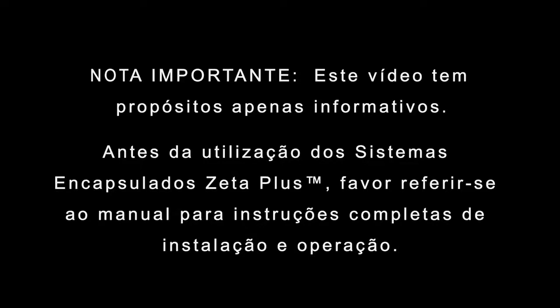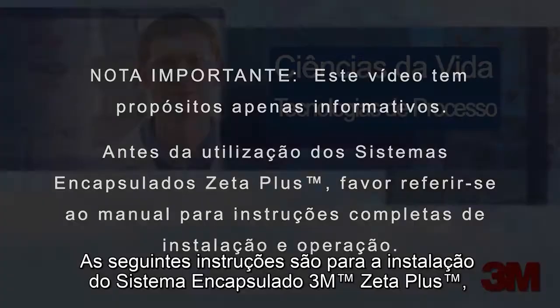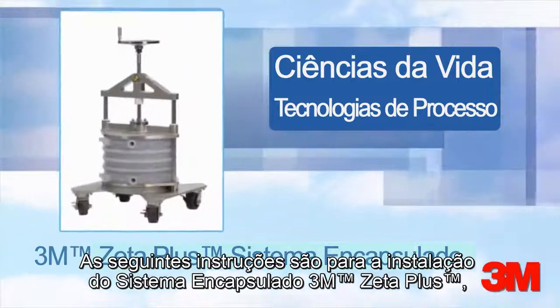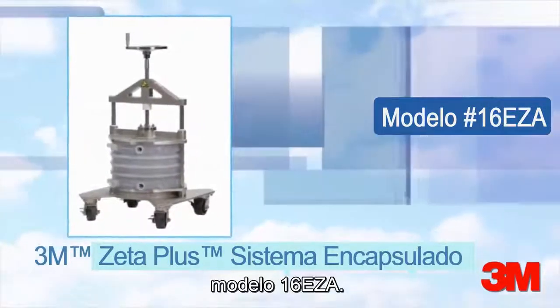This video is for information purposes only. Please refer to the system manual for complete installation and use instructions. The following instructions are for the installation of the Zeta Plus Encapsulated System, model number 16 EZ-A.